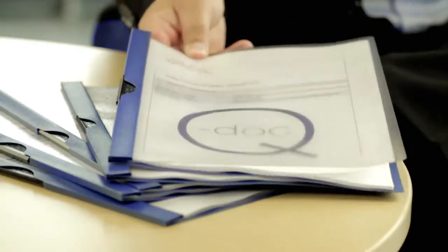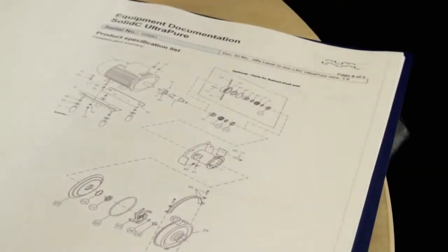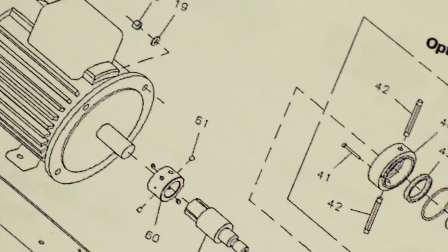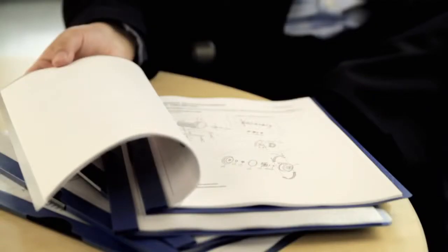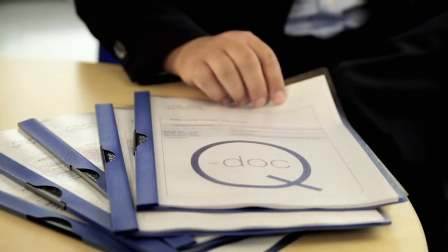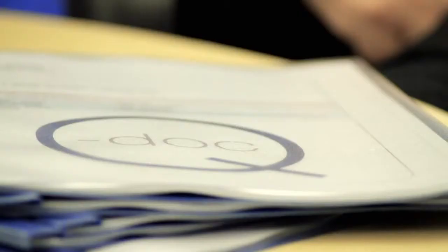All the pumps in Alfa Laval's Biopharm range are backed by the assurance of our Q-Doc documentation package, which gives you full transparency for every aspect of materials and manufacture, from raw material to final equipment delivery. No wonder they're trusted by leading manufacturers the world over.